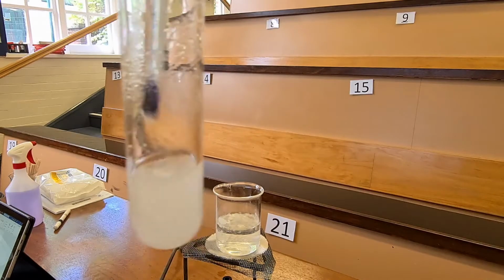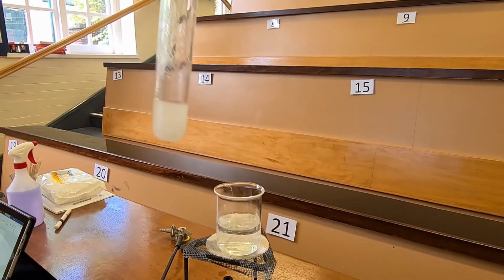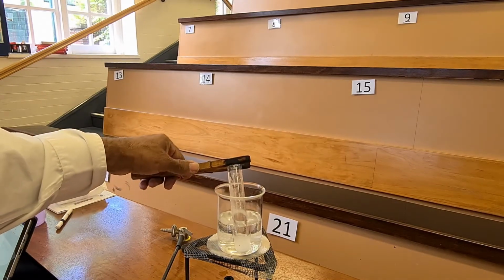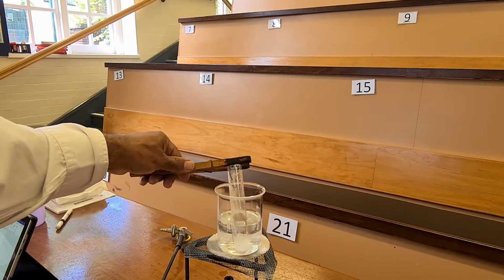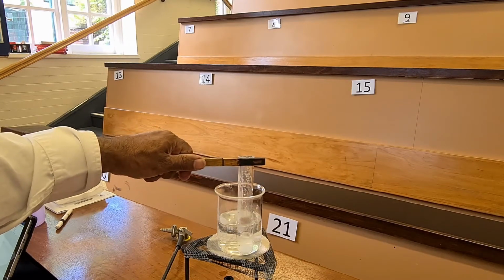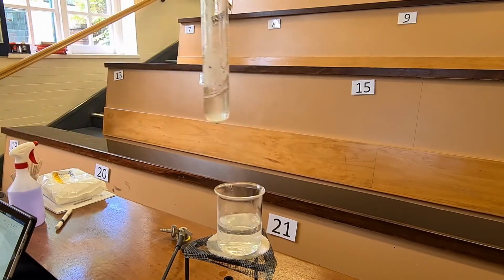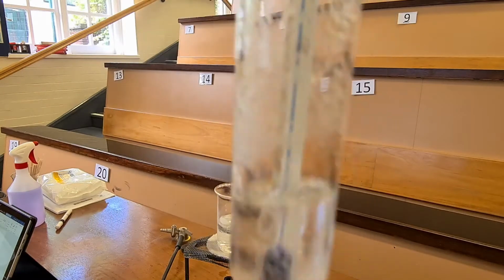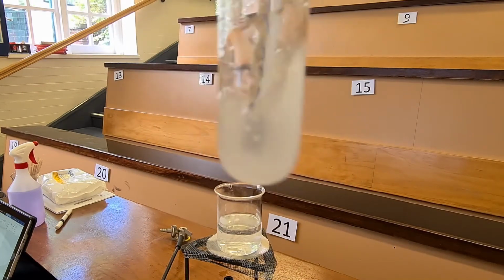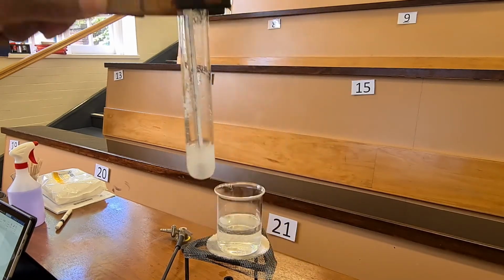I'm stirring with the thermometer, getting it to dissolve. Put it back in the hot water. There's still some solid left, it's not all dissolved.